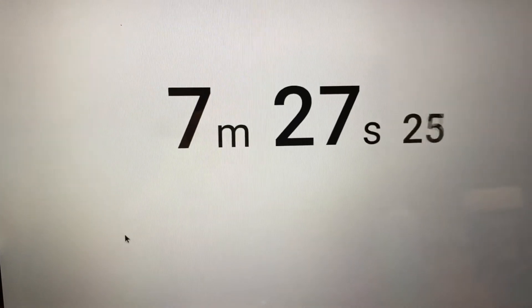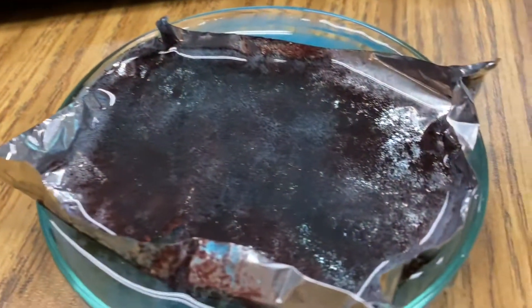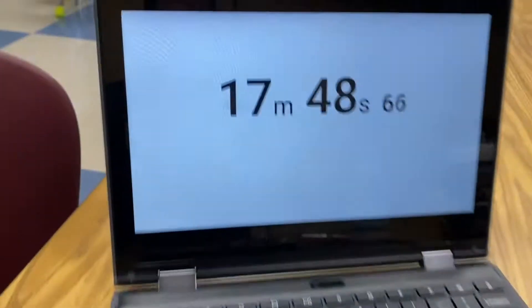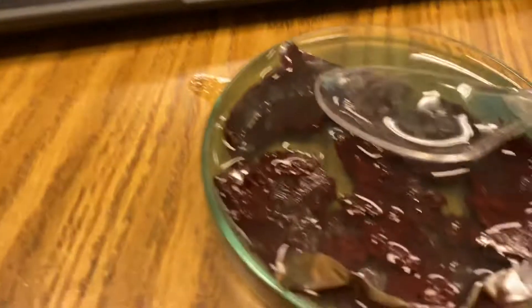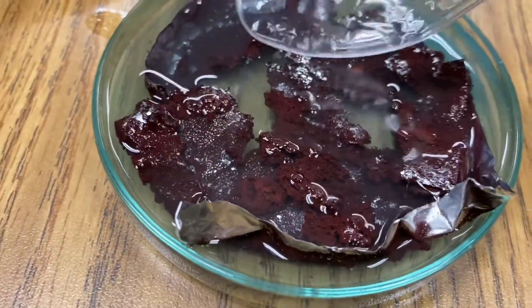So at this point we're just over seven minutes, and you can see our reaction is really underway. And here we are at about 17 minutes, almost 18 minutes, and look at this copper that was displaced by the aluminum.